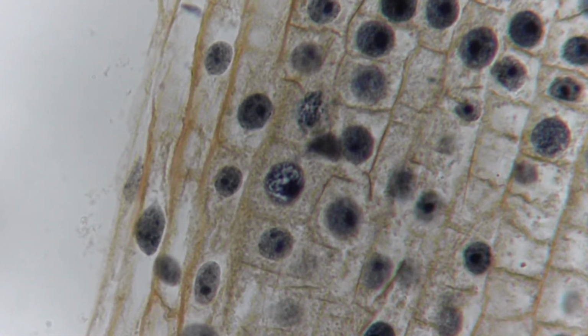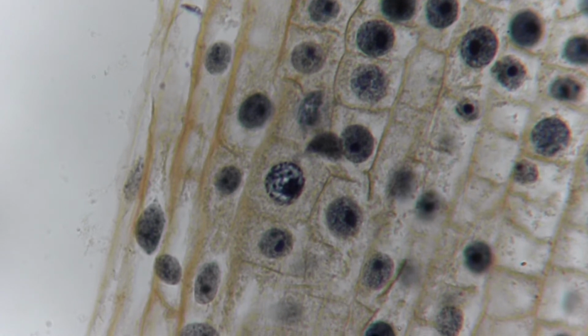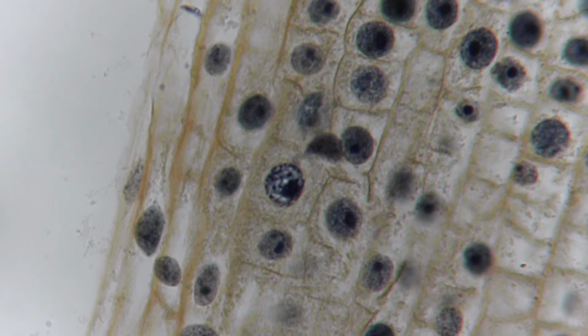And this is as large as I can make it for you. And so now you're looking for one that is about in the center of the screen, and you see it looks different from all the others around. You see white space because the chromosomes have organized, but they're not in any kind of pattern. It looks like that pile of worms that I used for my crutch. So do you see the one that looks different right in the center of the field?